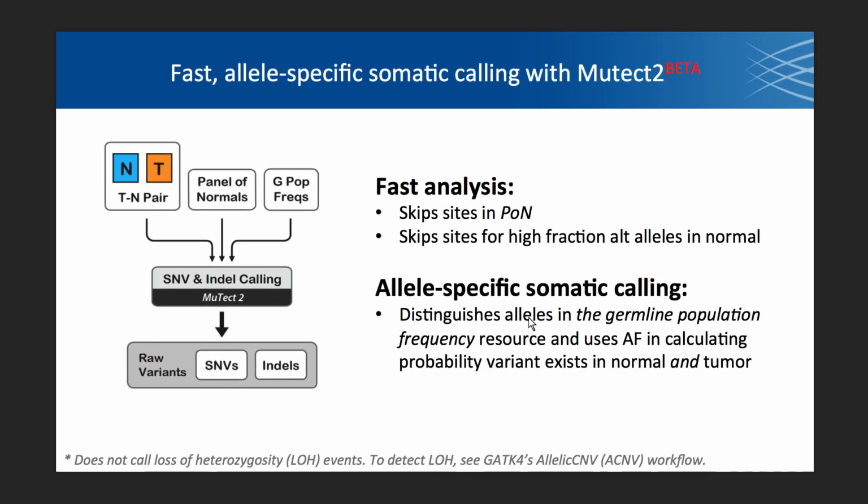Having tried both GATK3 MuTect2 and GATK4 MuTect2, I have to say it's much faster. If you ask our developers about it, and I should say the two main people who work on this are David Benjamin and Takuto Sato in the group, their office is right next door to mine, so it's easy to go ask questions.